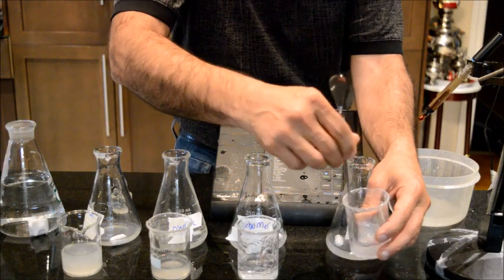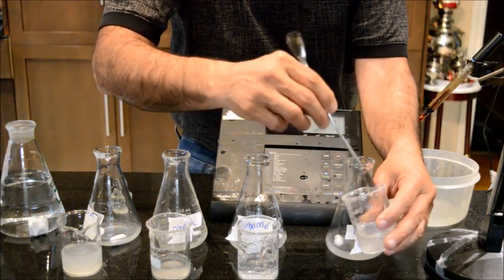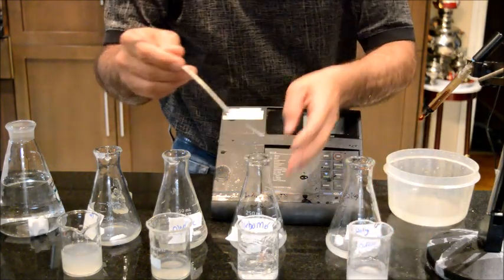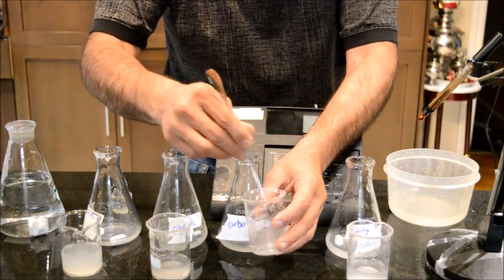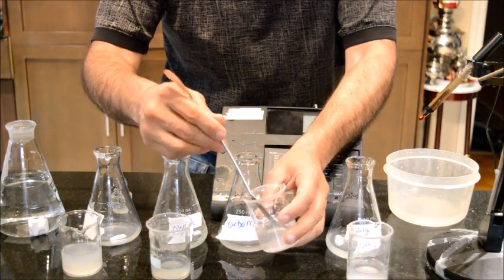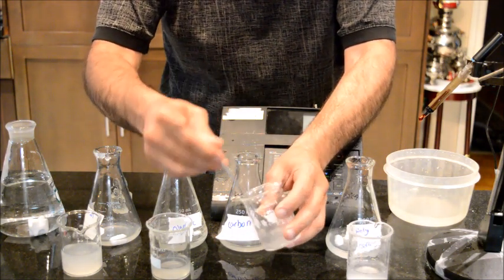First of all, the polycarbophil, I can immediately see that it is turning into a liquid. It's definitely losing its viscosity dramatically. Maybe some of it is due to the dilution, but some of it is actually incompatibility with the vaginal fluid. It's a similar behavior to the Carbomer. It becomes very liquidy.